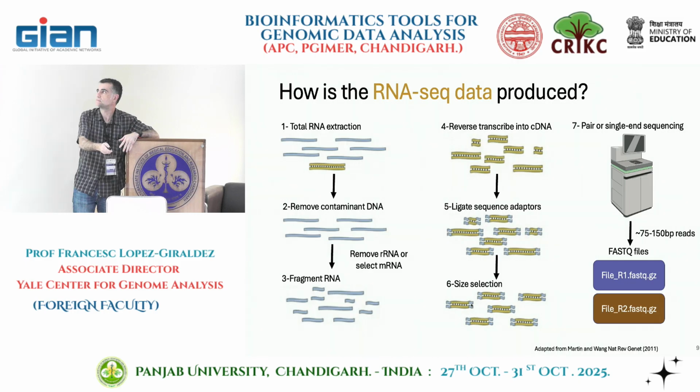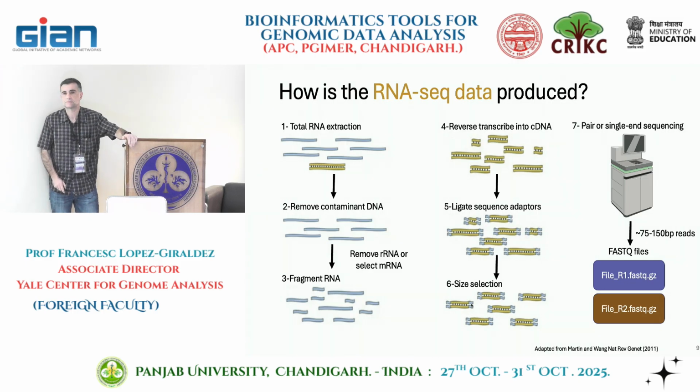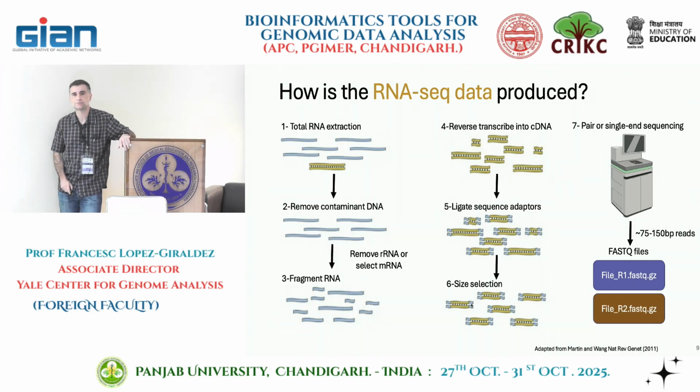Yeah, I just want to add one more thing, which I actually forgot to mention. Fragmentation. DNA fragmentation is actually straightforward. You can fragment DNA, and there's no intermediate step there. But for RNA fragmentation, there is an issue.